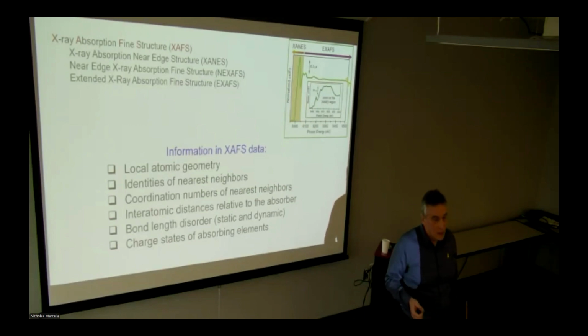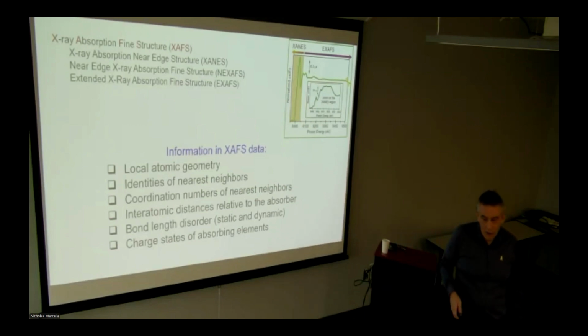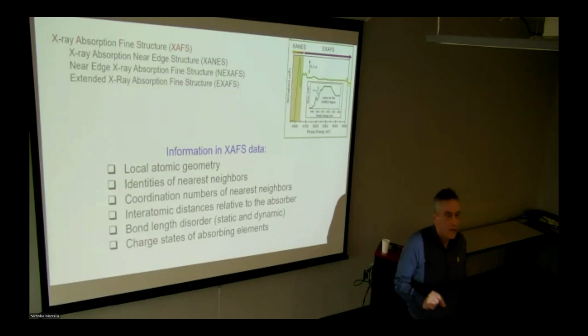Of course, you cannot go and measure something with a short scale if you have a wavelength which is two orders of magnitude longer, right? Or you cannot measure something which can have a period of atomic vibrations of the order of a few picoseconds if your characteristic time is nanosecond. But XAFS has exceptionally short characteristic time, of the order of femtosecond.